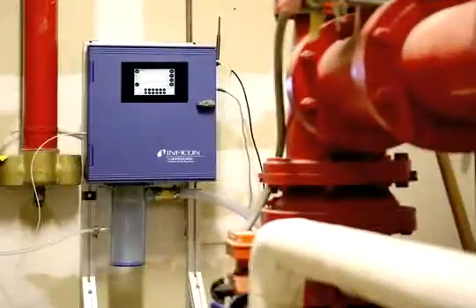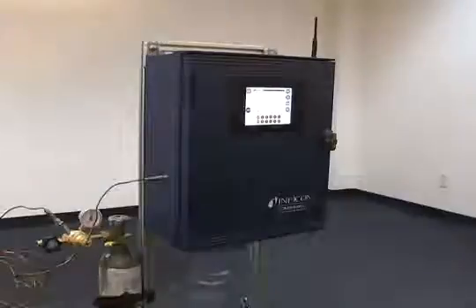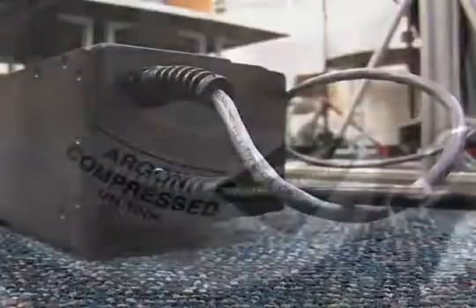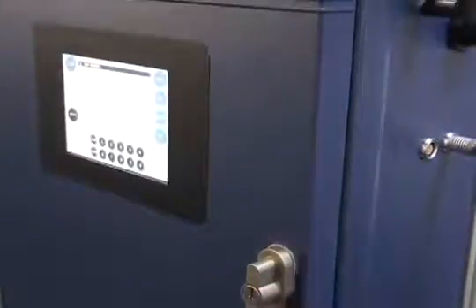The CMS5000 is a stationary instrument that can be wall-mounted or fixed on a stand. The instrument is designed for continuous, unattended long-term monitoring. The CMS5000 must have shore power available, as well as ultra-high purity argon for the carrier gas. The instrument is easily installed and simple to operate.